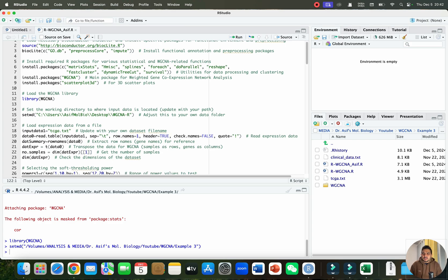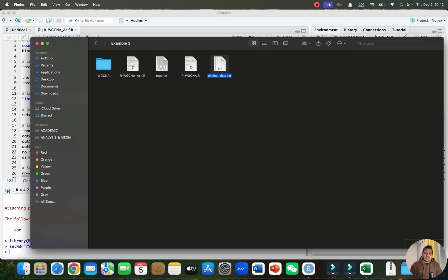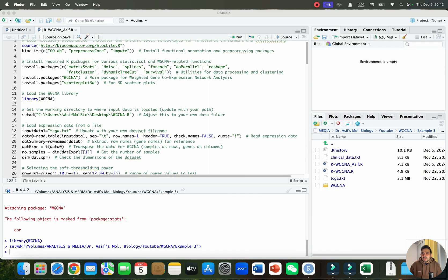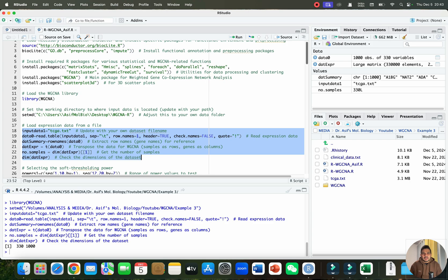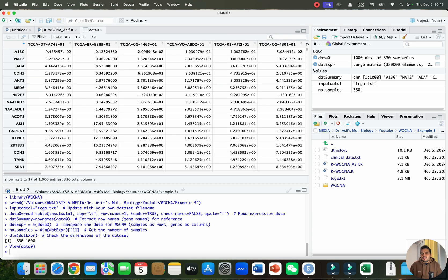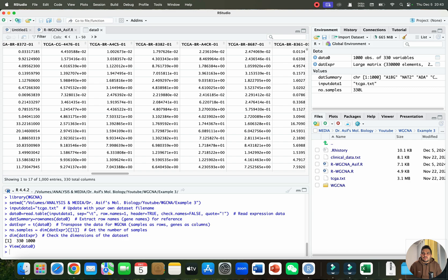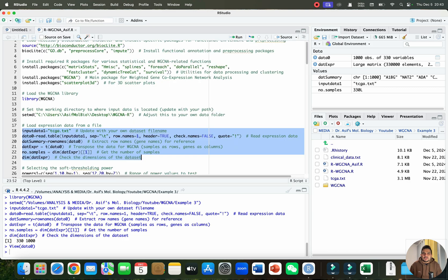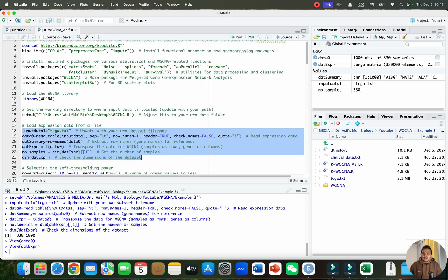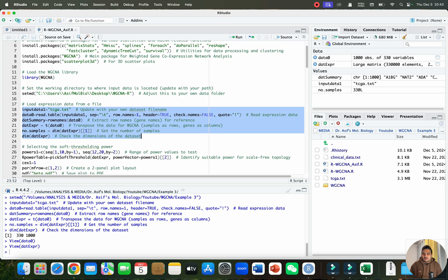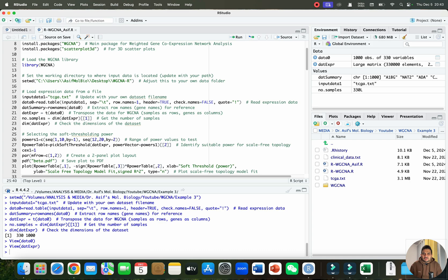Now let's formally begin by loading the expression data. Our input file is named the TCGA text file. After running this code, we have two datasets: one contains the gene list with sample or treatment names saved as data zero, and the other is the data expression matrix — the large matrix. We have removed the sample names for WGCNA purposes.